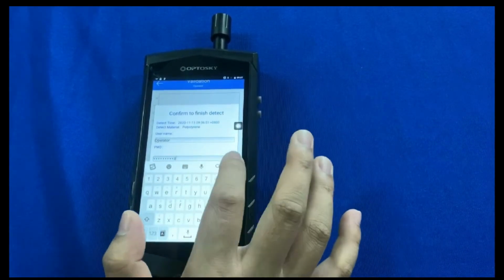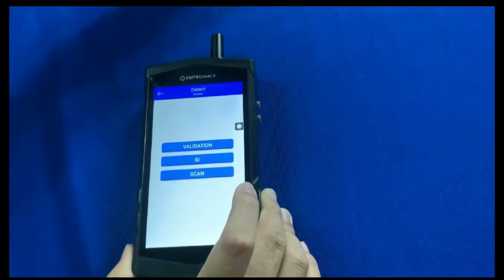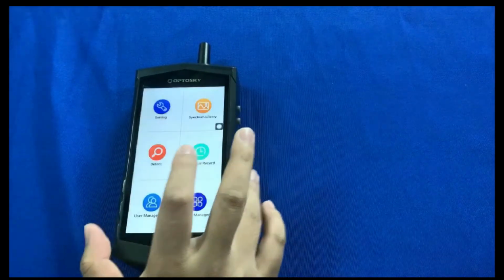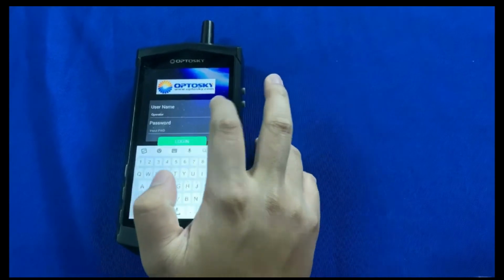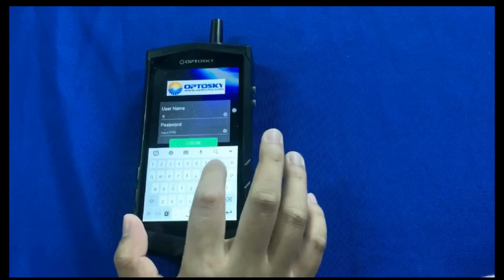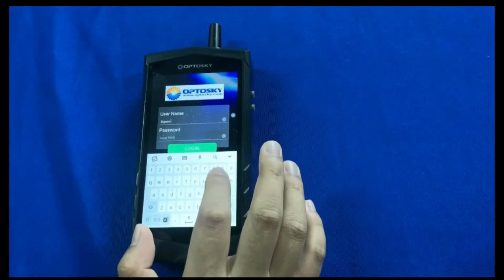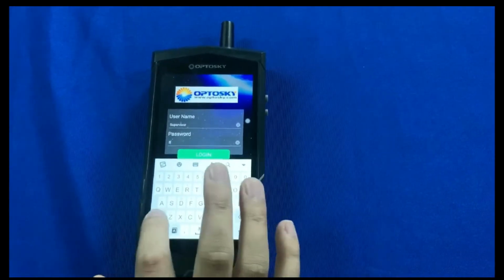And then we move to test 7, the setup method and identification and electronic signature test. First of all, we log in as the supervisor and create a new method name, paracetamol test, followed by scanning the barcode with the supervisor account.